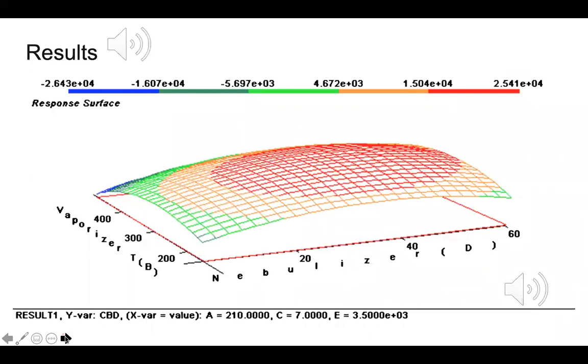So now let's talk about some of the results. Briefly, before I get into what this figure is here, I do want to mention that one of the results that they found was with the solvents that they tried. One of the main issues that needed to be addressed in the separation problem was the choice of solvent, right? And so they ended up trying six different solvent mixtures.